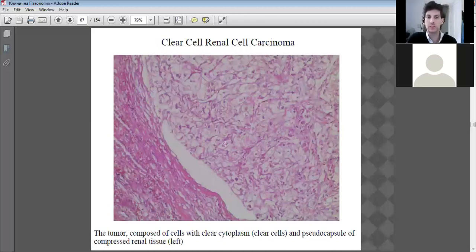Good cellular detail of the compressed nature of the tumor. And here we can see how packed the cells are, and the nuclei are evident in certain cases, but the cells are of abnormal size and shape, and they are dividing, but in an abnormal way, as is the characteristic of a tumor.